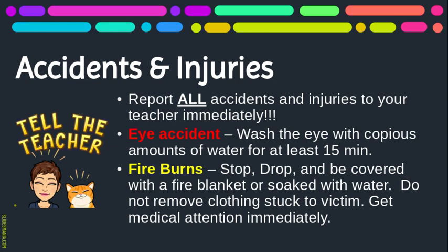Fires and burns. So the standard is stop, drop, and roll. You learned this when you were a kid. I don't have a fire blanket in my class. I do have a shower, and most of you have already figured out that I have that. So should something spill on you and your clothes, your pants, your shirts, or you catch on fire, we're going to pretty quickly go over to the shower, and I'm going to shove you in the shower. Clothes on and all, and you're going to get super cold and super wet.